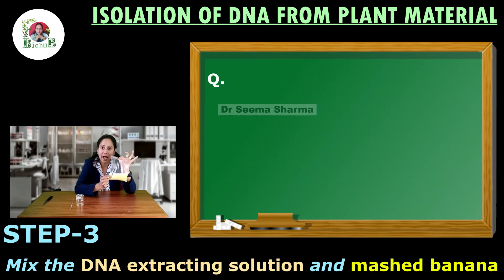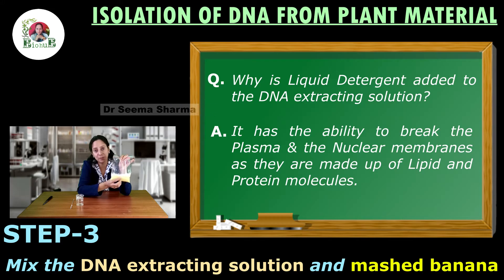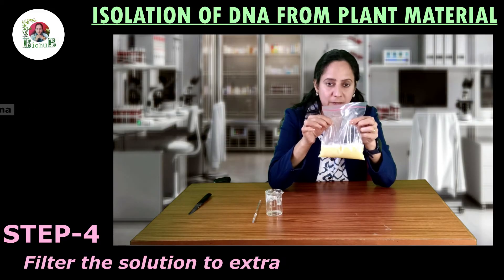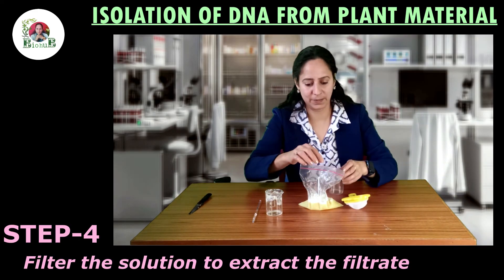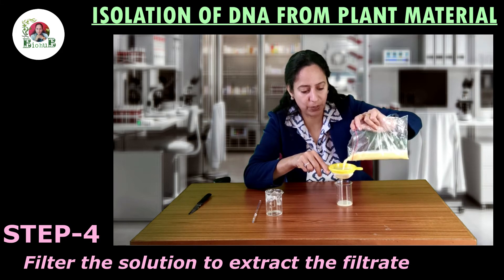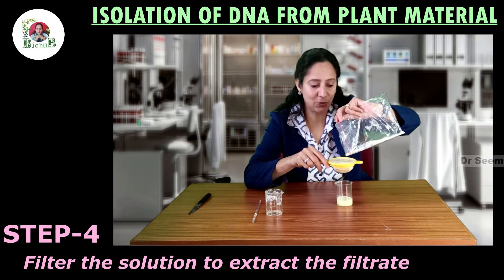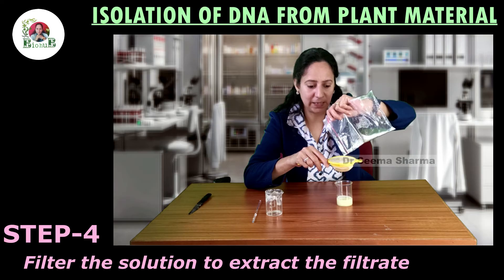Now this concentrate is ready. The next step is to filter the extract. For that we need a strainer and one beaker. Straining will help us to separate out most of the cellular debris from the liquid filtrate. You have to be very careful while performing it — it will take some time. Now you can see the majority of cellular debris has stayed back in the strainer and the extract has passed out and got collected in the beaker.